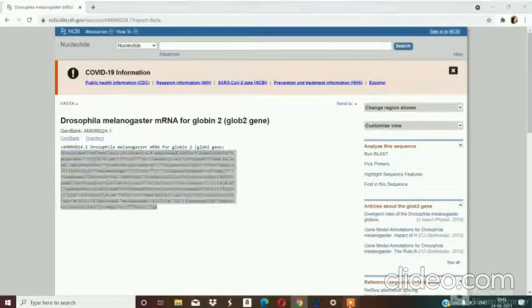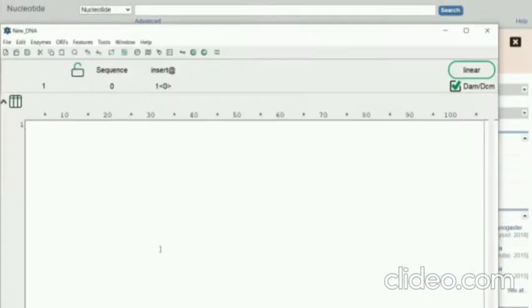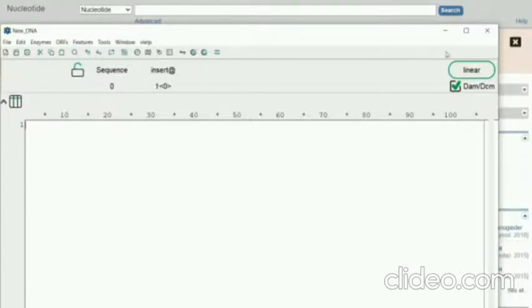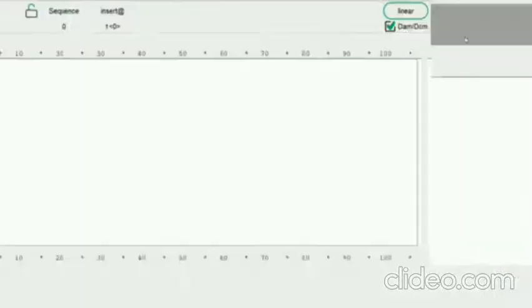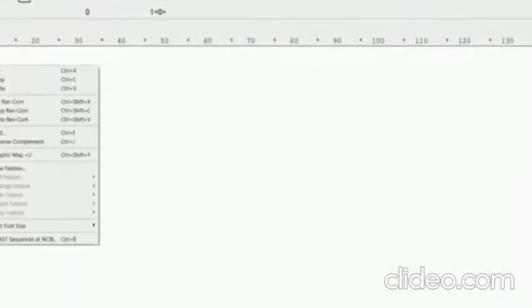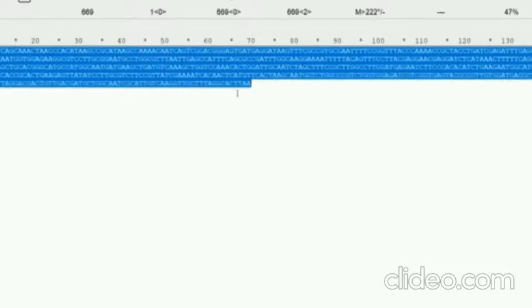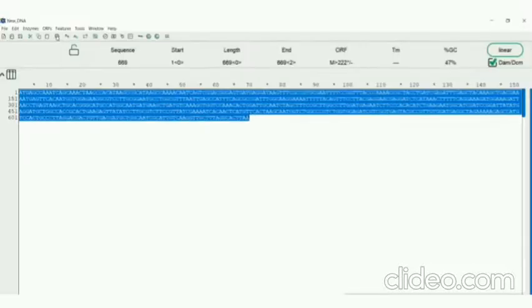And paste it in the graphical user interface of AP tool. This is the AP tool. Now I am going to paste it. This is the sequence. We have to select the sequence.